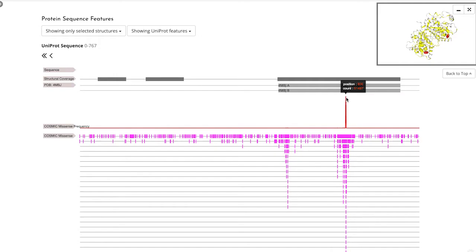The most commonly known mutation in BRAF, V600E, is very clear to see on our frequency graph. But you can see more details on the graph below in pink. Each mark is an individual mutation.